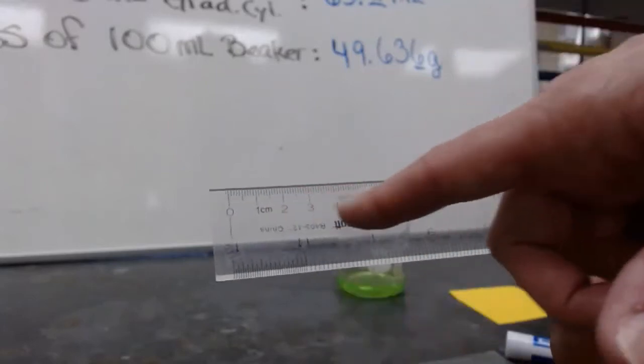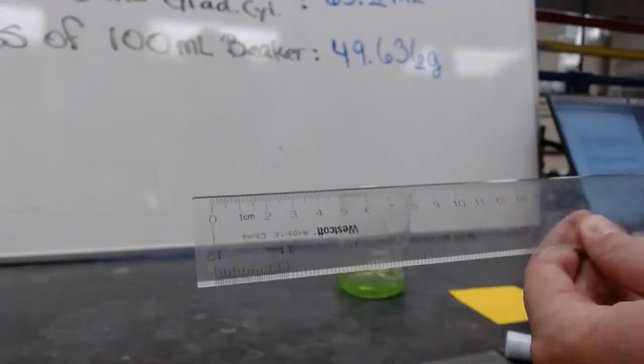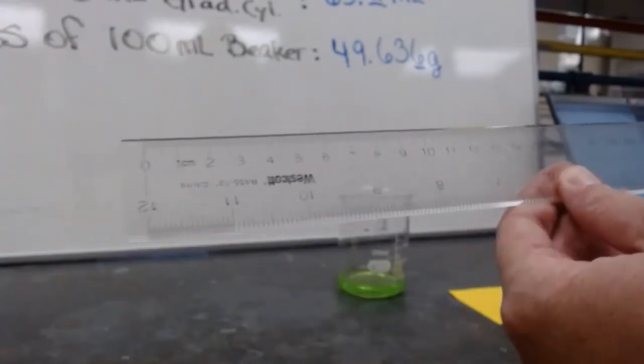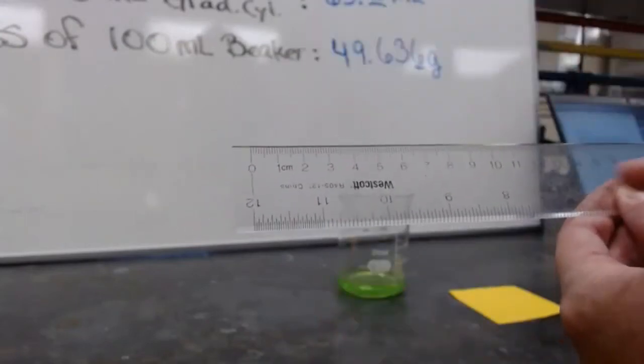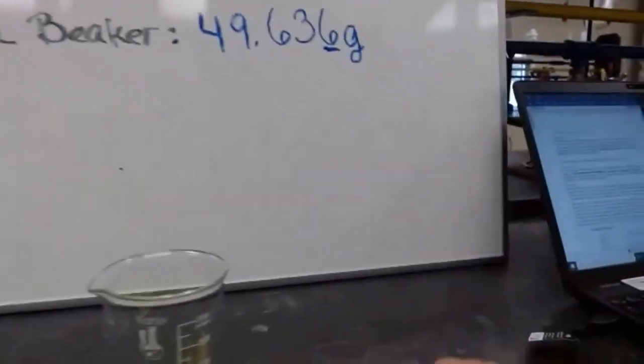The good thing about these rulers is that they are clear, so you can see through them. So whenever you want to measure something, you want to place it directly on top of it, because you can see through it, and it's easier to line them up and see where the end of what you're measuring falls. So I have a Post-it right here.